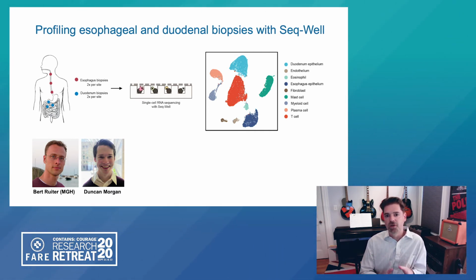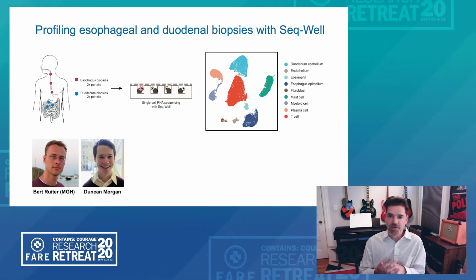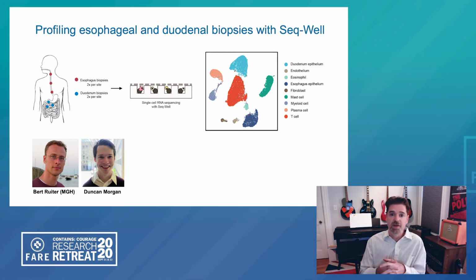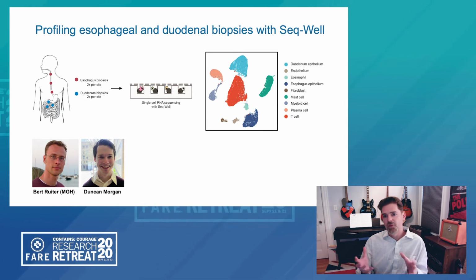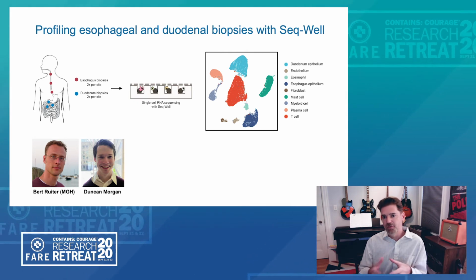Through the process of capturing those cells on the array, we can now identify by transcriptome the different populations shown here in the UMAP. You can see different populations that are present here. In particular, I'll draw a note to the teal-colored population, the small population that represents the eosinophils. Obviously a hallmark of the disease, and nice to see these granulocytes captured in the single-cell sequencing data. You can also see there's populations of mast cells, and we've seen some evidence for neutrophils as well. There's a major population of T cells as well as some of the other epithelial cells, and what we can ask now in an atlasing sort of way is what types of cells are there and what pathways are being expressed.